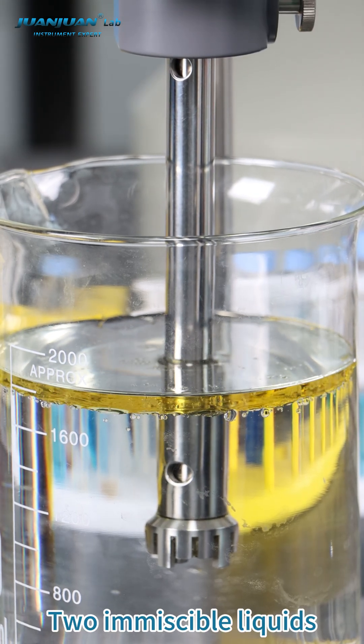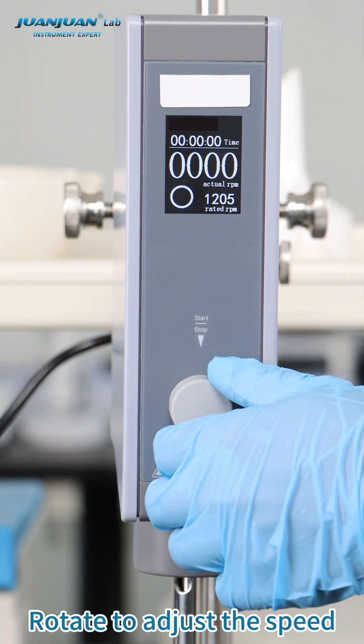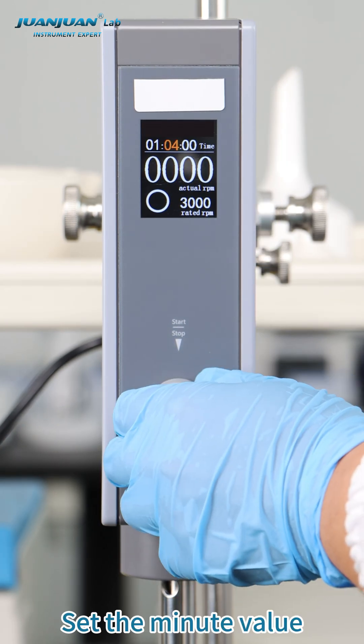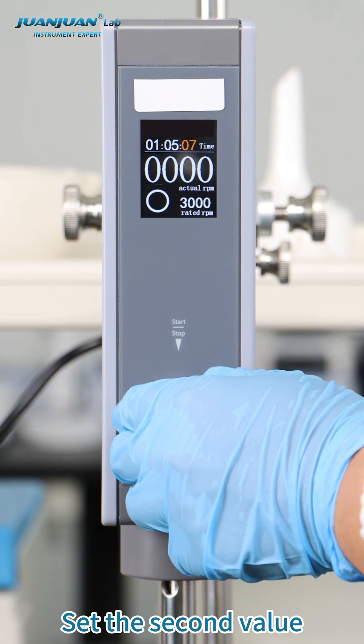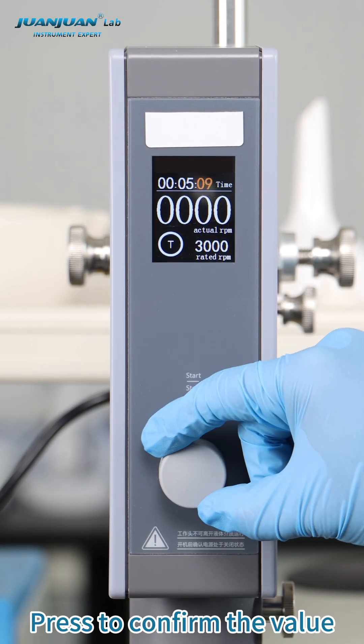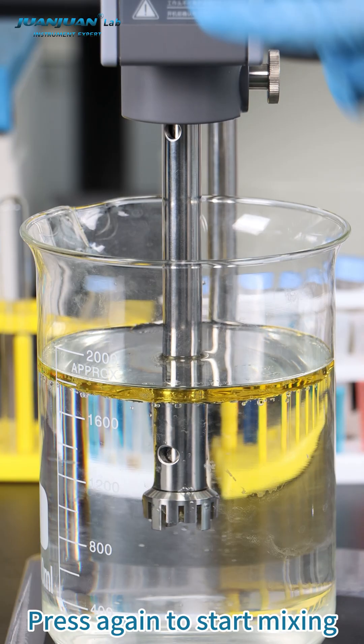Two immiscible liquids. Rotate to adjust the speed. Set the hour value, set the minute value, set the second value. Adjust the desired runtime. Press to confirm the value. Press again to start mixing.